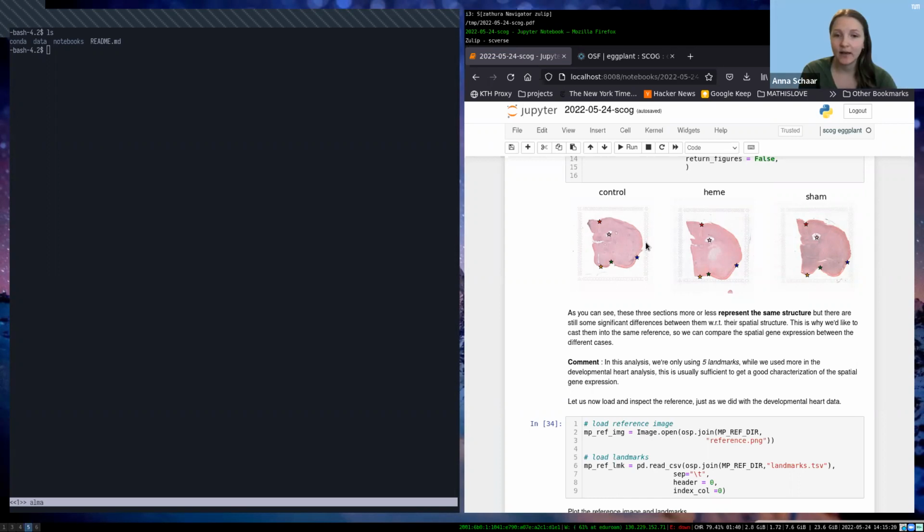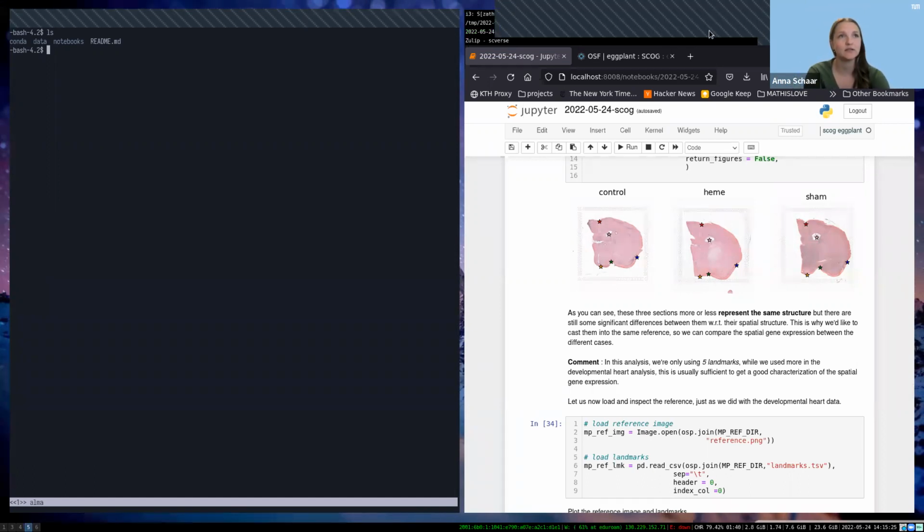Yes. But nevertheless, thank you. And sure, raise the question again if you want more answers with respect to this, or Alma's opinion on it. We have one additional question in Slido. If you use spots from Visium, would you lose information if the slice is rotated or if it's measuring at different axes? So is this not a problem for the method?